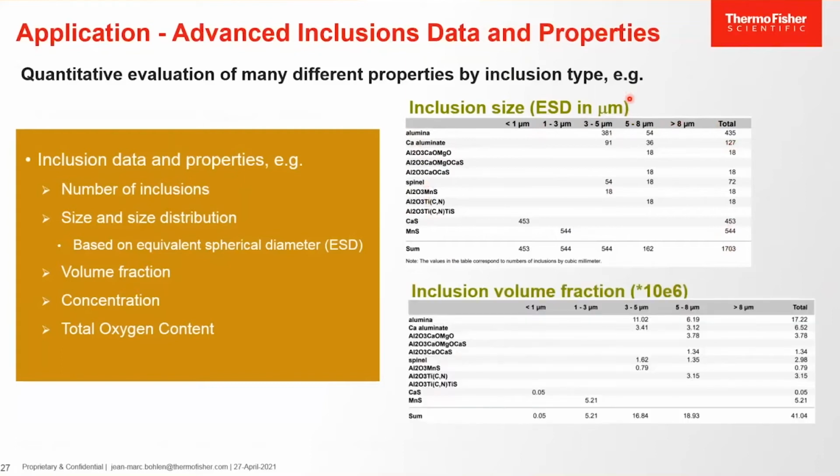Another example is the inclusion volume fraction. Again, for the same inclusion, now you have an evaluation of the fraction of the volume for the inclusion in the different classes and for the total.